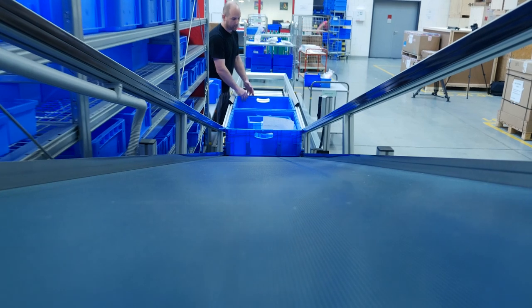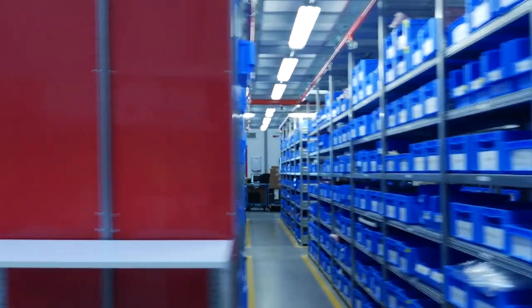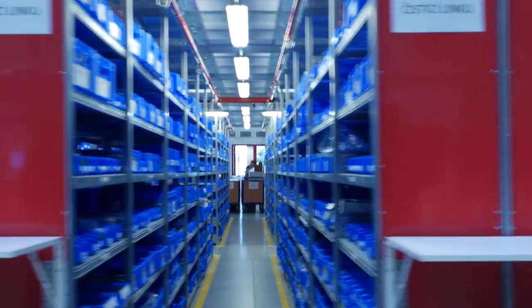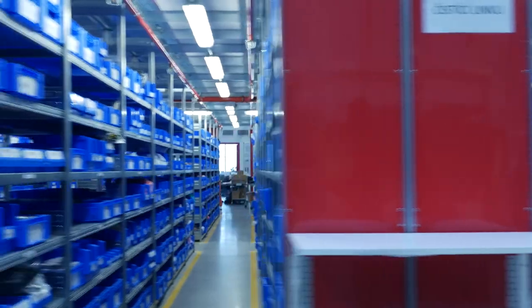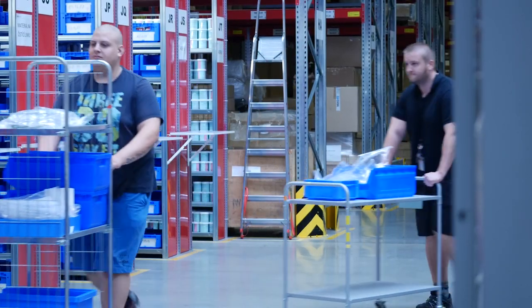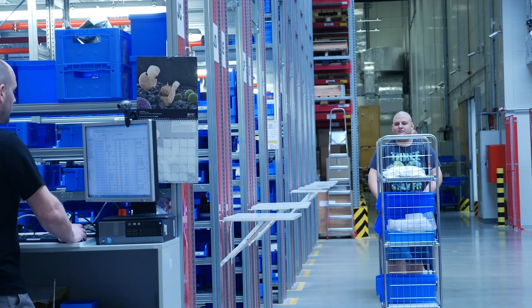The microscope consists of many parts, thousands or even tens of thousands of parts in one device. The logistics department usually orders about 8,000 items from 400 suppliers for the production in Brno. Some items are so special that their delivery takes up to 200 days.